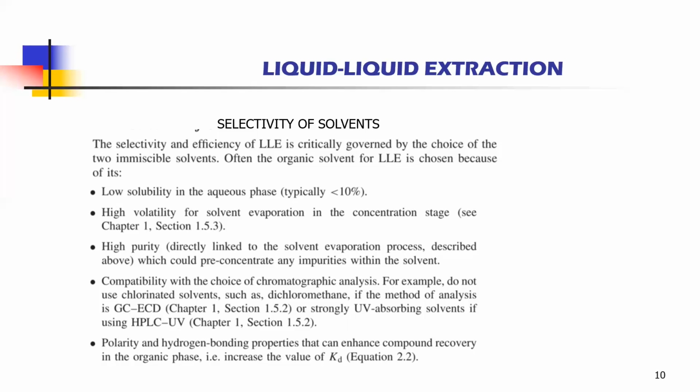Often the organic solvent for liquid-liquid extraction is chosen, first, because of its low solubility in the aqueous phase, typically less than 10%. It should have immiscibility. Then only can we choose the organic solvent for liquid-liquid extraction.